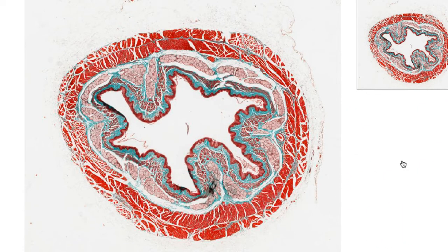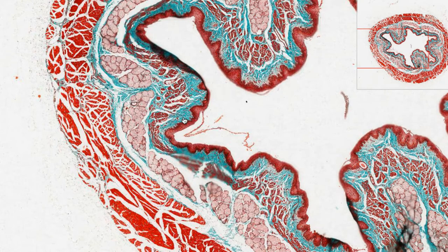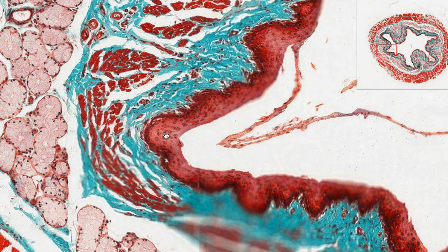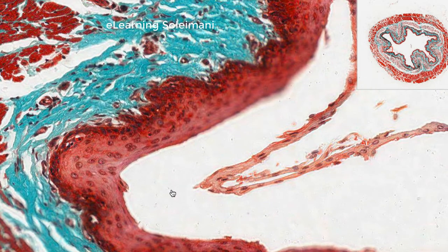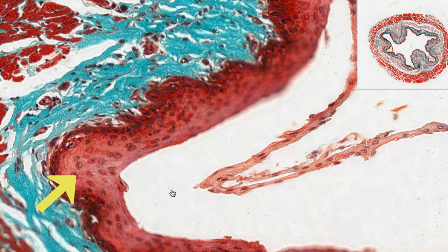The next slide is the esophagus. The epithelium is non-keratinized stratified squamous. With higher magnification, the larger central lumen can be seen in the bright space. The epithelium consists of basal cells on the basement membrane, followed by cuboidal cells, and the most superficial cells are squamous with condensed nuclei.